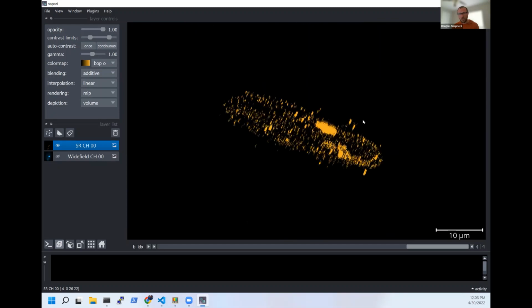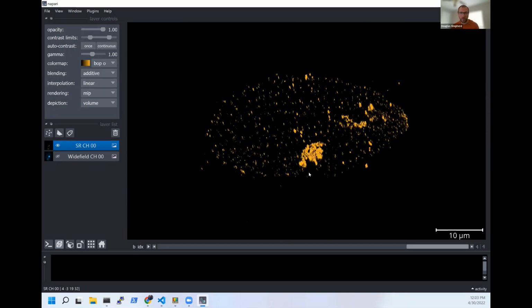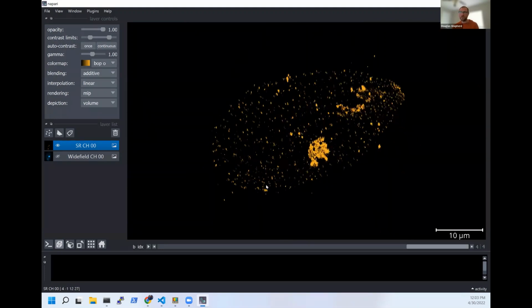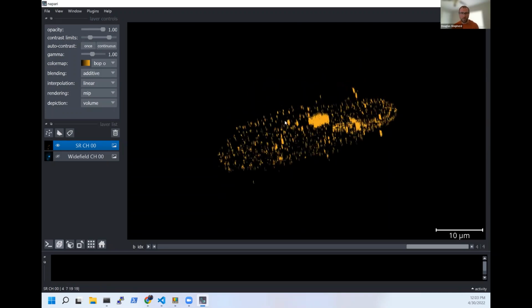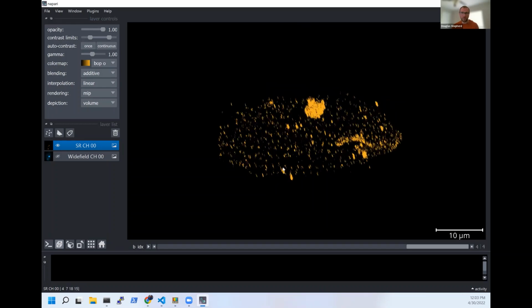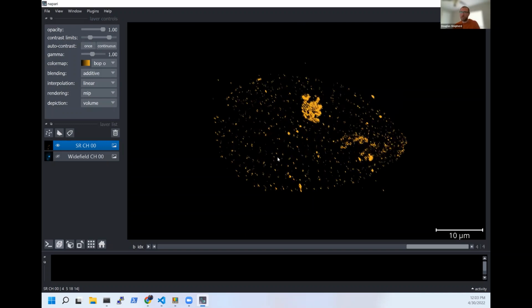So we really think this optical sectioning method that was introduced by Sean O'Halloran is incredibly powerful. And this is one nice feature that's included in our software that a lot of the commercial reconstruction softwares don't include. So if you want, again, to get the best reconstruction possible, one thing you could do is open a GitHub issue and ask Peter for the parameters that he used for this. The other thing you could do is just iterate over a few Z-planes, checking both the band exclusion parameter and the Wiener parameter to try that. And I'll leave that as an exercise for you to work on.